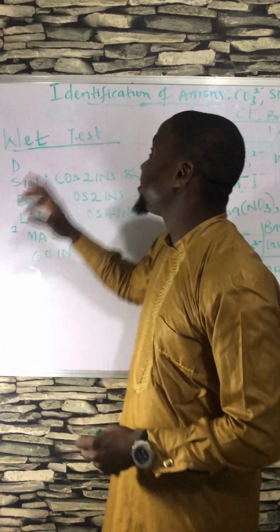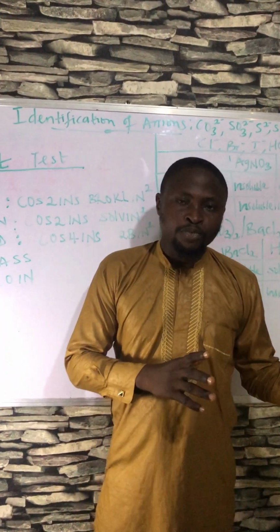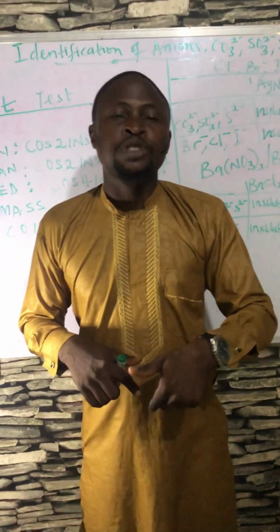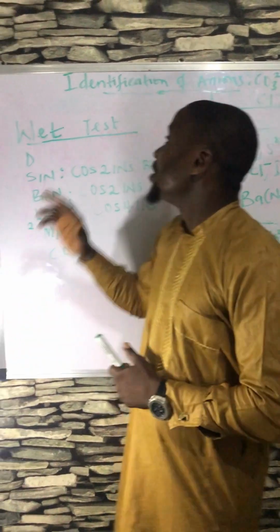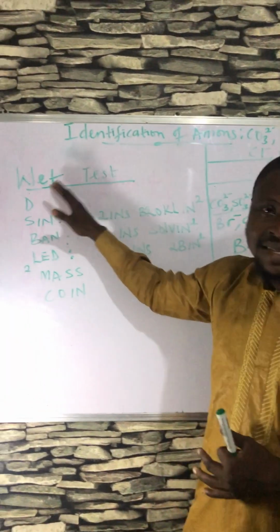Today, we want to look at identification of anions. Truly, we've done a list of videos concerning this. If you have not watched it, please check the description below. Basically, tonight we are going to be looking at the wet tests.